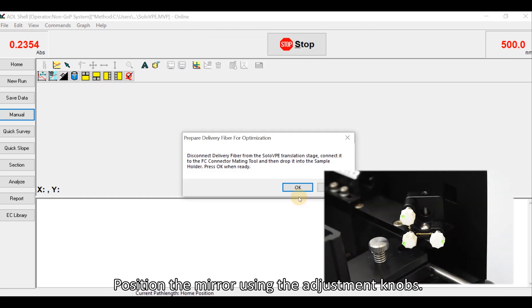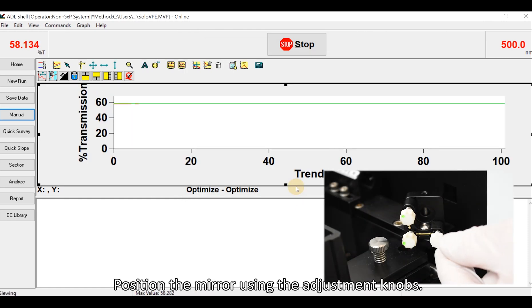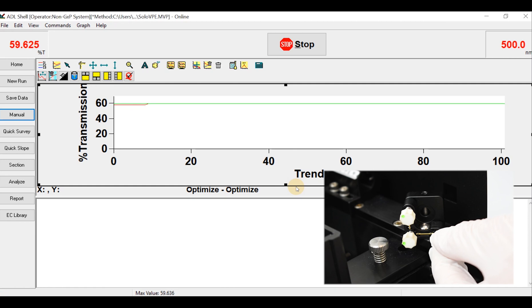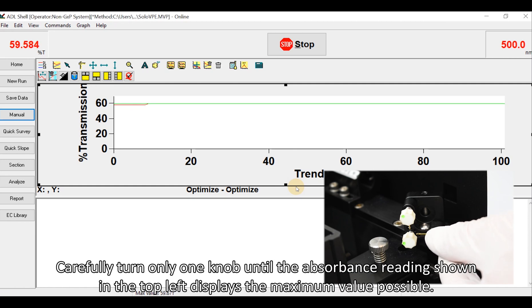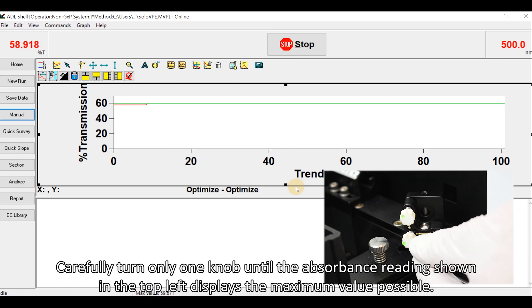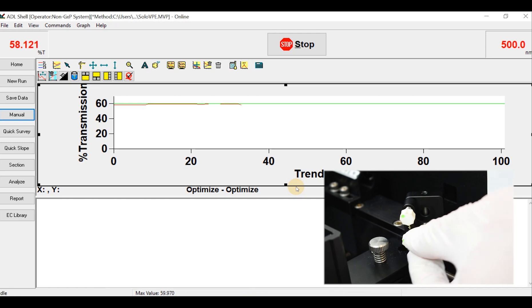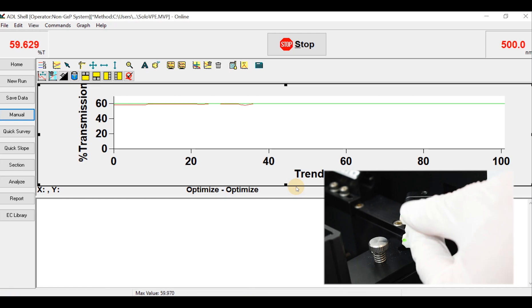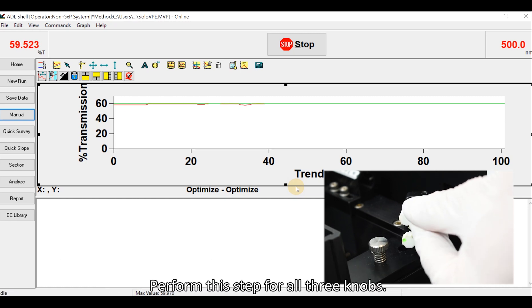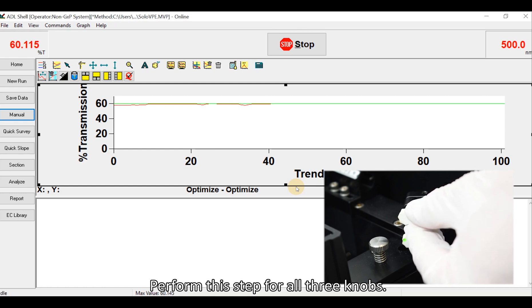Position the mirror using the adjustment knobs. Carefully turn only one knob until the absorbance reading shown in the top left displays the maximum value possible. Perform this step for all three knobs.